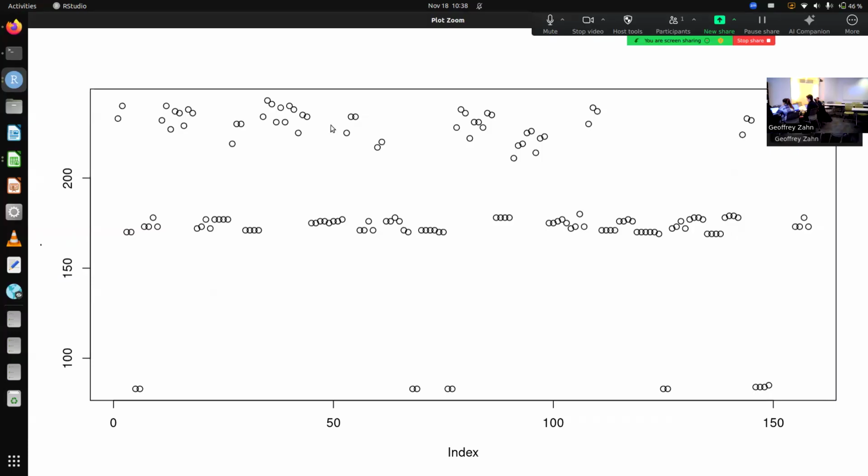What you can't do is say 300 here. Then you lose all your samples. So a good healthy rate would be like 100, just based on looking at this. Yeah, so just looking at this, I'd say you can cut off below all these samples or above them. That'd be a substantial change to the pipeline.